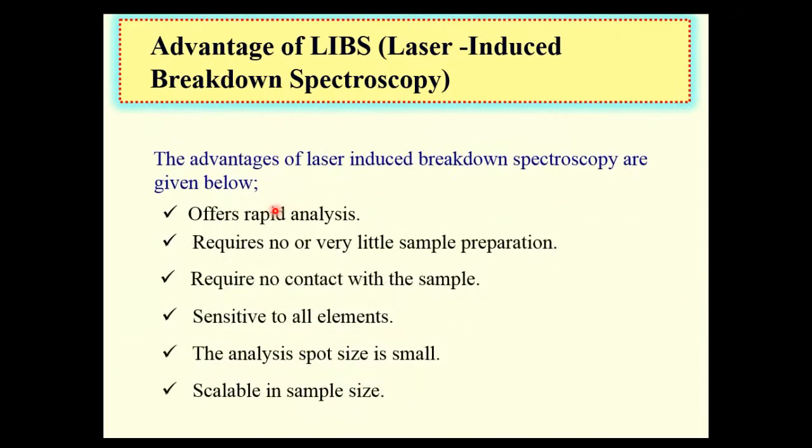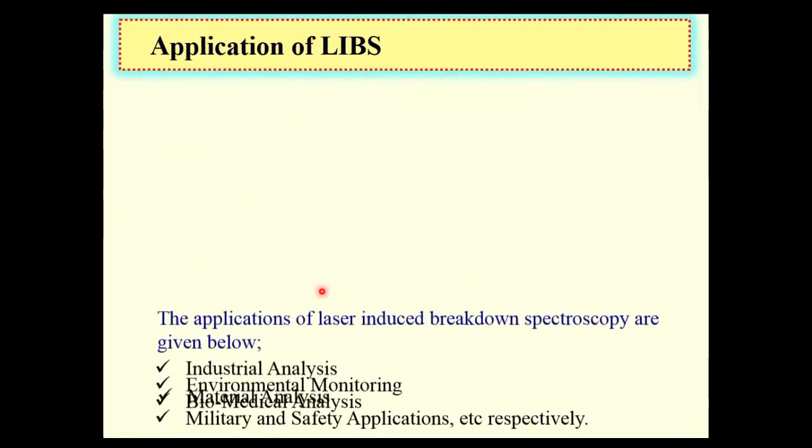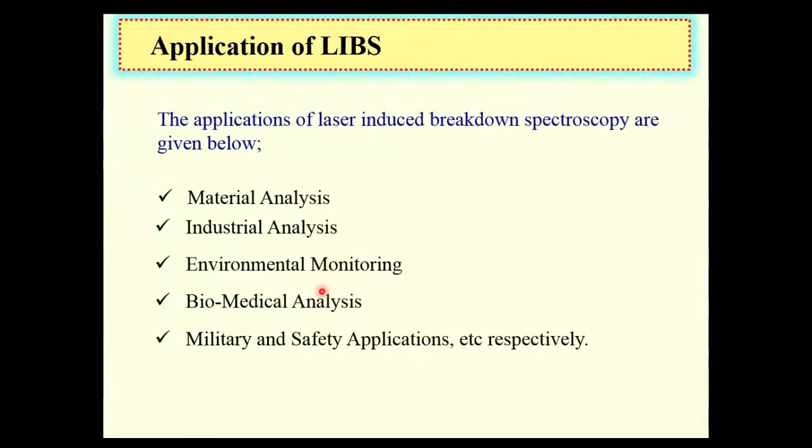So, advantages of LIBS. LIBS has many advantages: it offers rapid analysis, requires no or very little sample preparation, requires no contact with the sample, is sensitive to all elements, the analysis spot is very small, and it is scalable in sample size. It has many applications throughout the globe, such as material analysis, industrial analysis, environmental monitoring, biomedical analysis, military and safety applications, etc.